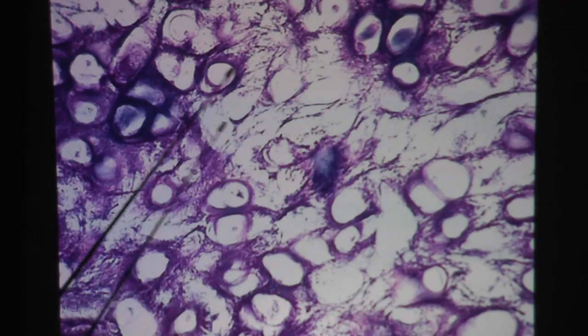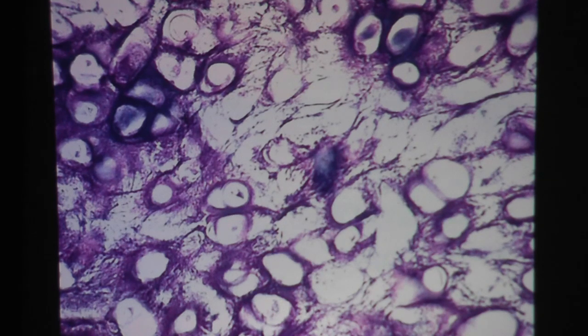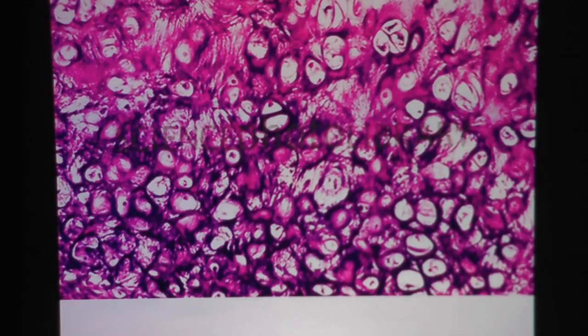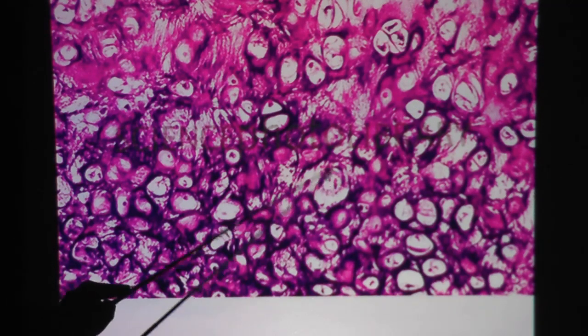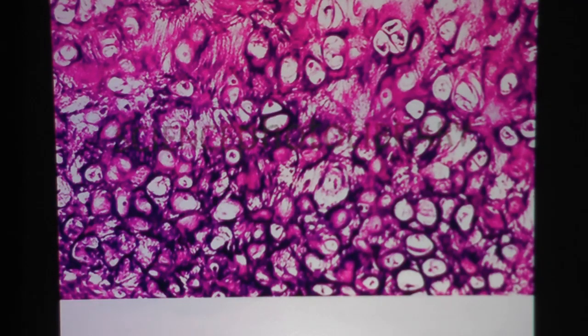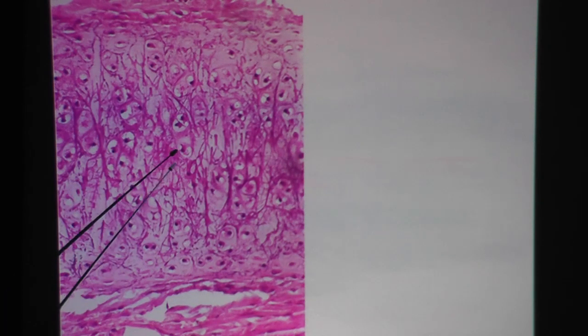Pretty much random — no real distinct direction, like it was with collagen fibers and fibrocartilage. Here you can see the very dark matrix with the chondrocytes in lacuna for elastic cartilage. Here's a somewhat low-power view but you can still see the little lines for elastic fibers, with chondrocytes in lacuna. Elastic cartilage.